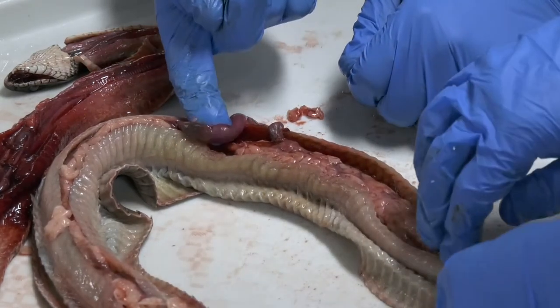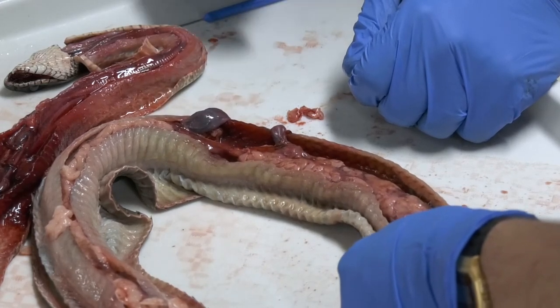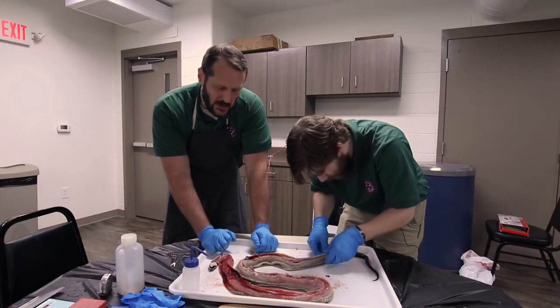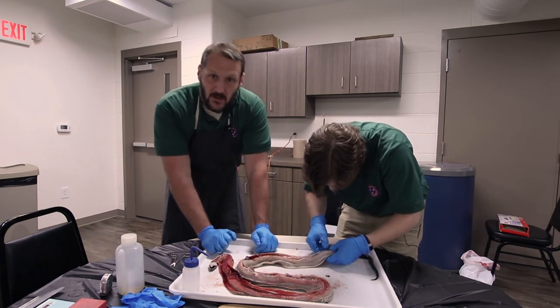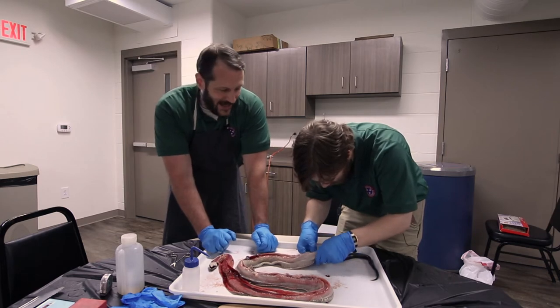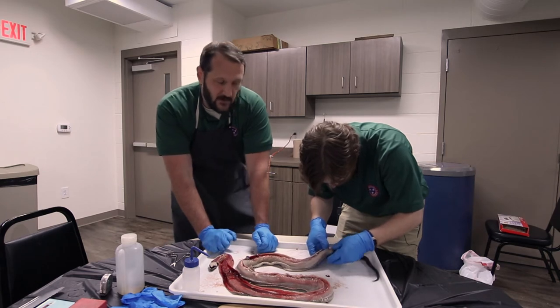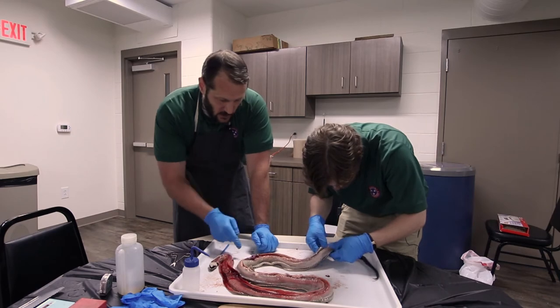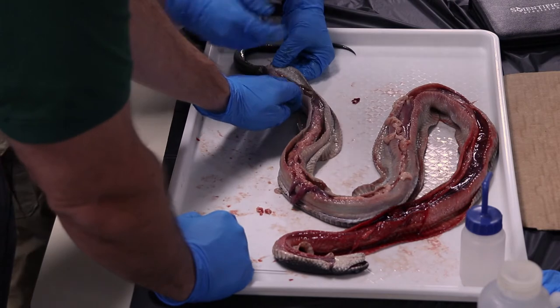What the gallbladder does in animals that have it, it stores that bile to be released in a large quantity all at once to help digest especially really fatty foods. And if you think about the nature of carnivory versus herbivory, some plants are high in fats, but generally speaking, plants are not fatty foods. It's meat is where you find most of the fats, and you find the need for storage of bile in a gallbladder. Would this be part of the urogenital system here?